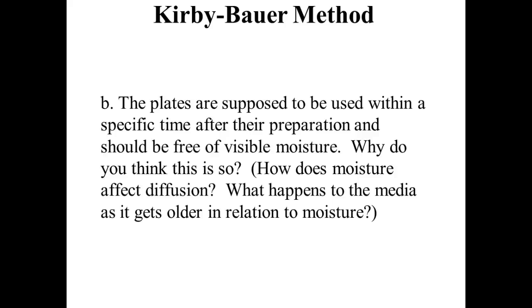The other thing is that we prepared those fresh today, in lab today, and there's a reason for that. As you sit them in the refrigerator, depending on how you keep them, it'll affect the moisture content. And does moisture affect diffusion? Yeah, if they're too dry, it's not going to diffuse as far. And if they're too moist, then it's going to diffuse further. You can very simply demonstrate this if you take a wet paper towel and a dry paper towel and put 1 drop of dye. You'll see that the dye will spread out further on the moist paper towel as opposed to the dry one, because that moisture is going to help spread it.